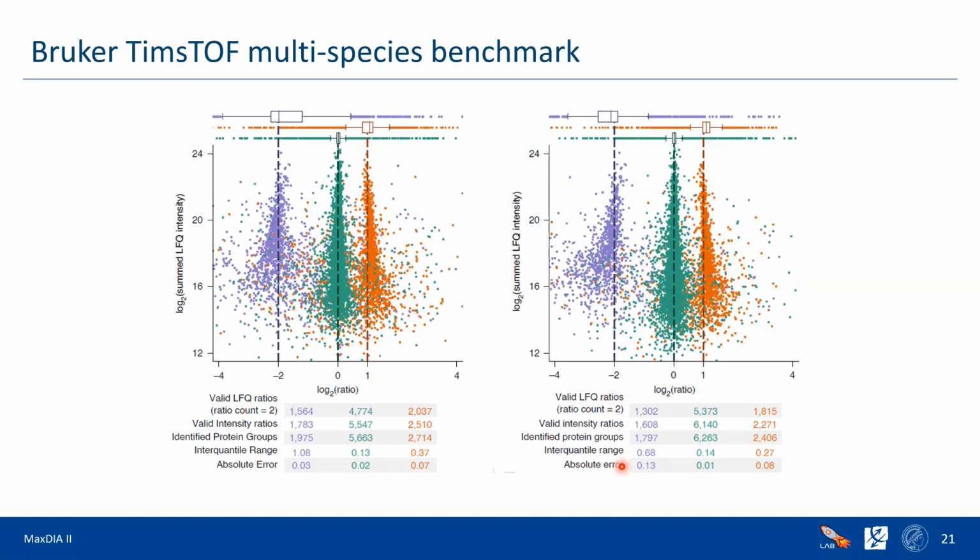And there we also see that we're usually getting either similar or, for some species, better results between discovery and library mode, so left library mode, right discovery mode. So we're getting pretty similar results, but with the big advantage of using discovery mode, that we don't need to measure a big, very deep library for each species which we are measuring. We are really just predicting at once and using it all the time.